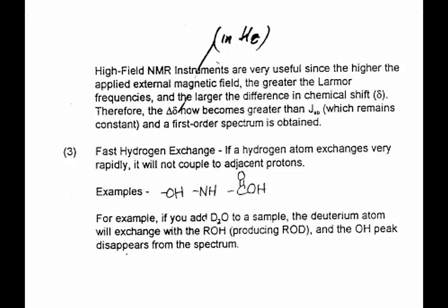My magnet is the radio, and my console is the radio station. How long is that analogy going to work for, right? Radio stations. The one you have in your car that's not attached to the internet, that radio. The radio station sends out 300 megahertz.